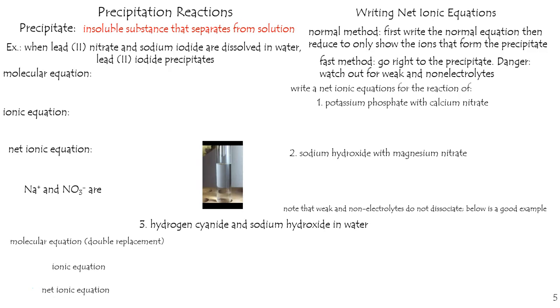they're ever so slowly going to add a drop of lead nitrate into a sodium iodide solution. And watch when the lead iodide precipitates. This is a classic view of a precipitation reaction. In this case, forming this nice canary yellow precipitate.